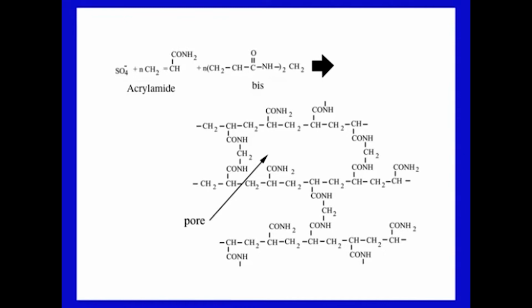All right. So, this figure shows the acrylamide molecule, and this is bisacrylamide. Long chains of acrylamide are formed, and in between these two chains bisacrylamide gets inserted. As this cross linking occurs, depending on the concentrations, the pores will be created.